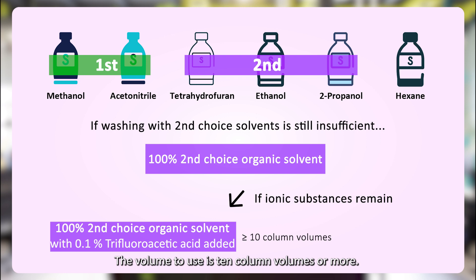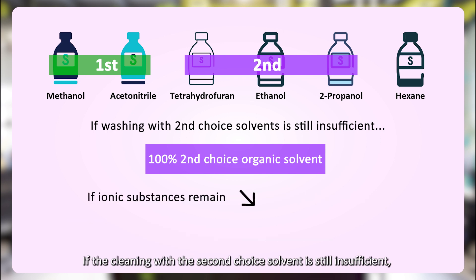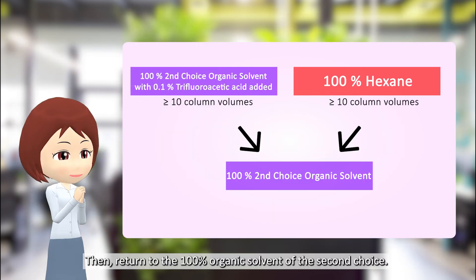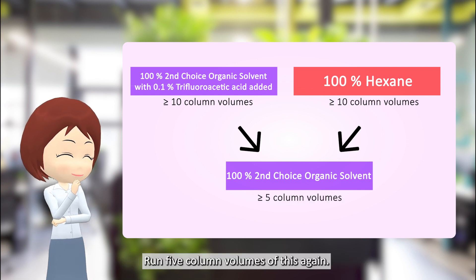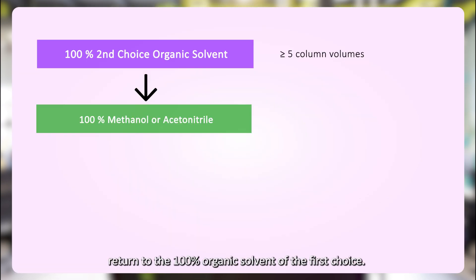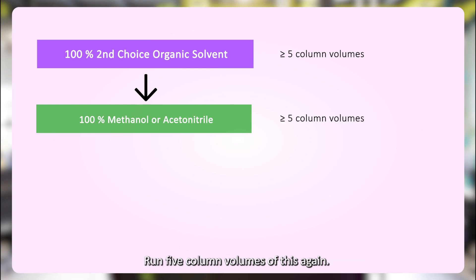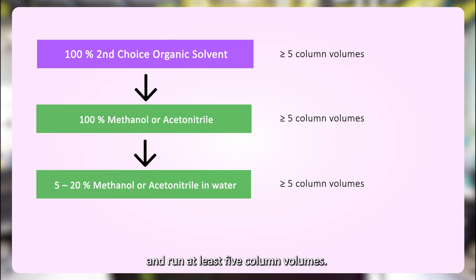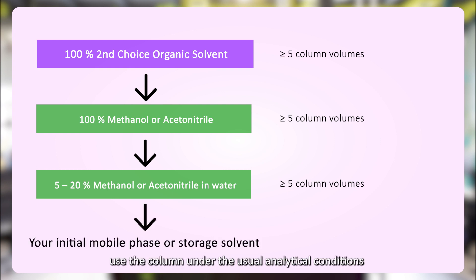Use 10 column volumes or more of this solution. If highly hydrophobic substances remain in the column, use hexane as the final choice, also with 10 column volumes or more. Then return to the 100% organic solvent of the second choice and run 5 column volumes again. Finally, return to the mixture of organic solvent and water and run at least 5 column volumes. After that, use the column under usual analytical conditions and check whether the column has recovered or not.